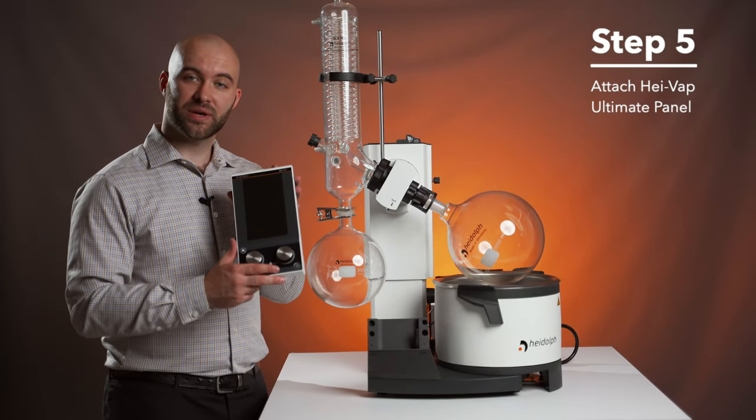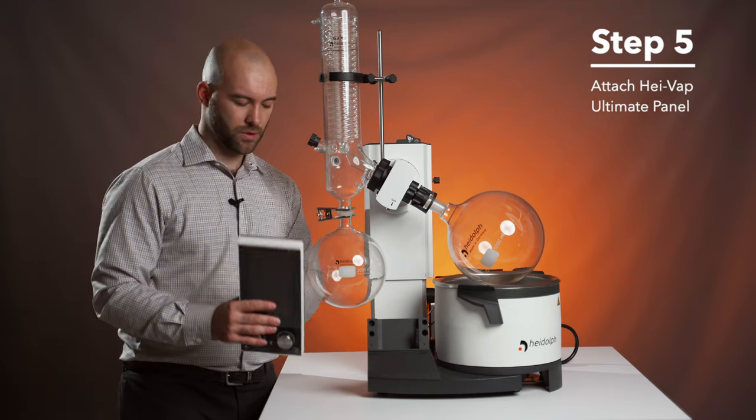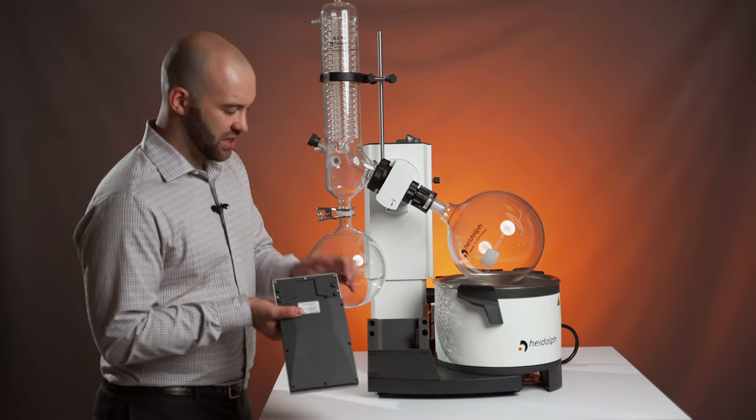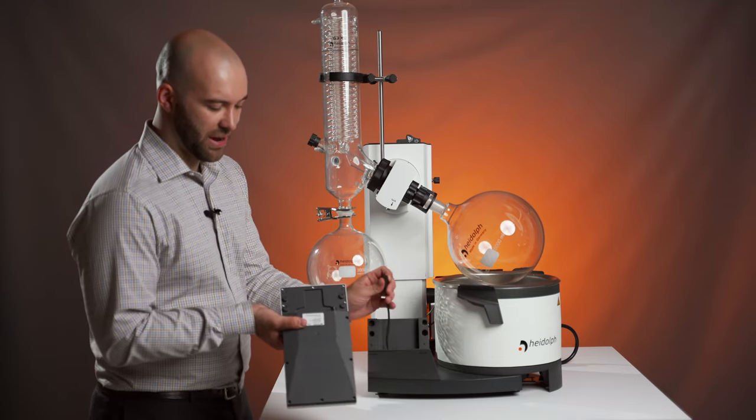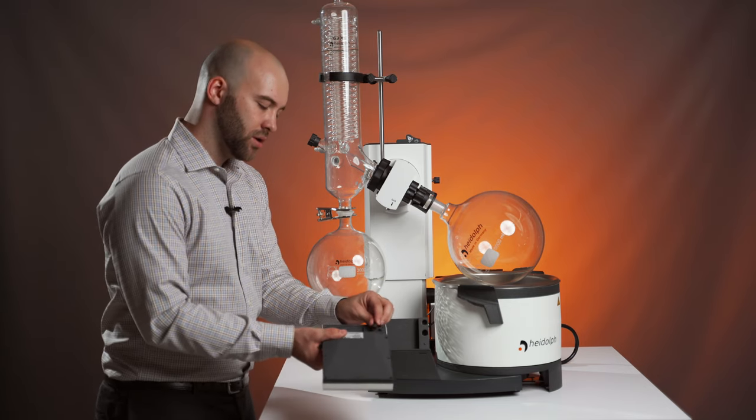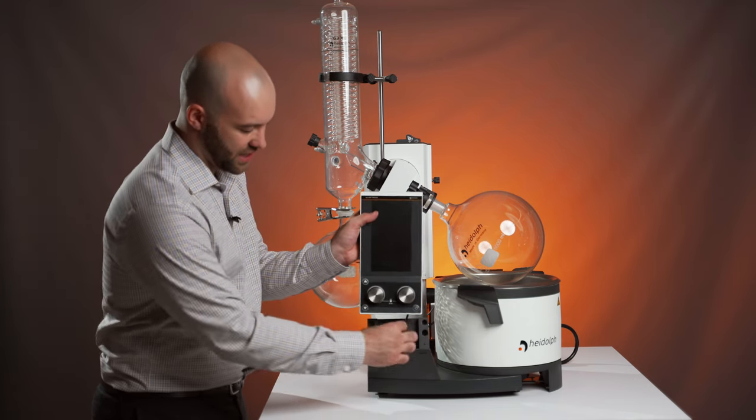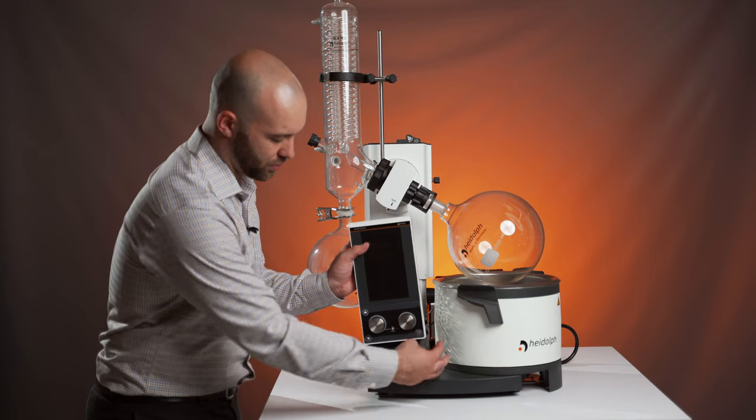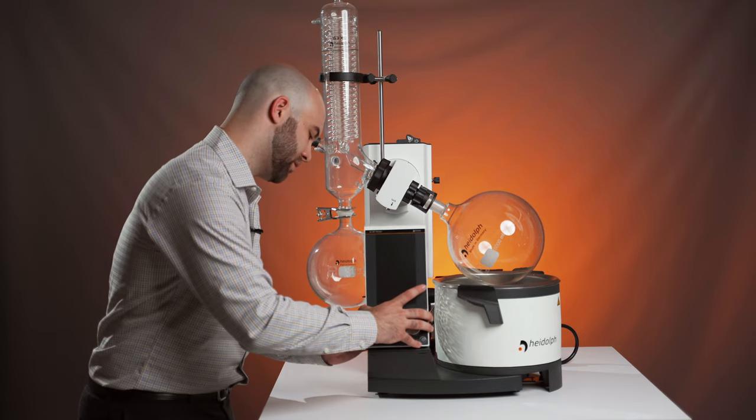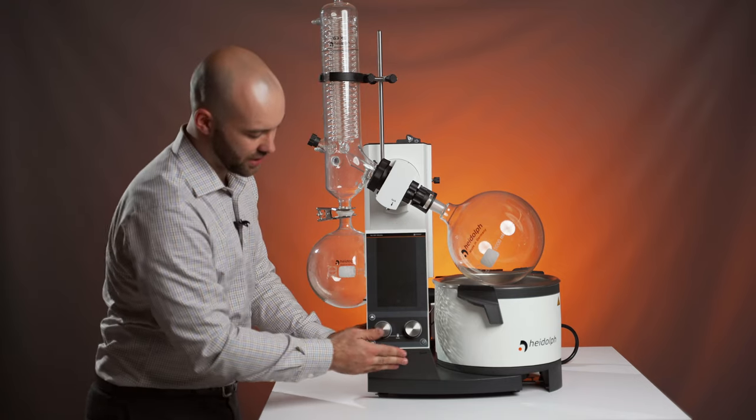Step five, we're going to attach our HiVap Ultimate panel to our HiVap. You're going to see a white notch on the back of the panel and the white notch on the cable on your HiVap. They're going to slot into each other to connect and you're going to slide this cable back down through the hole. Line up the four slots and push down until you hear a click.